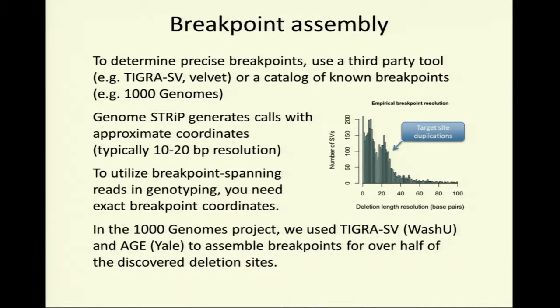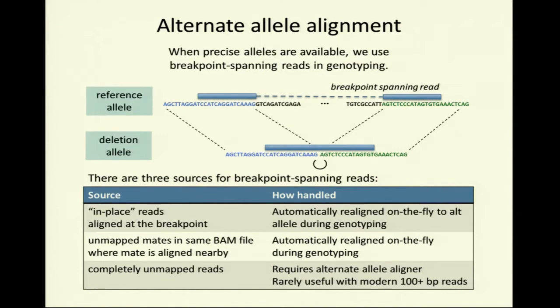Yeah, in 1,000 Genomes we used Tigra-SV, and we also used AGE from Yale to assemble breakpoints. We actually ran both, and then we took a consensus of the breakpoints between the two.